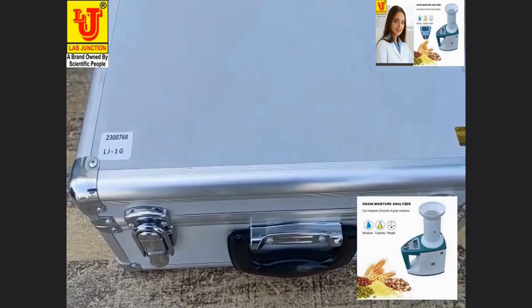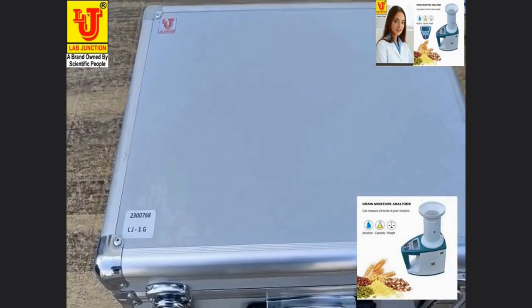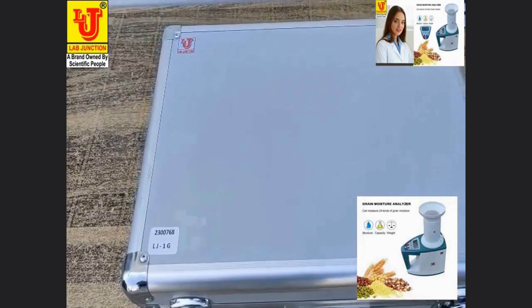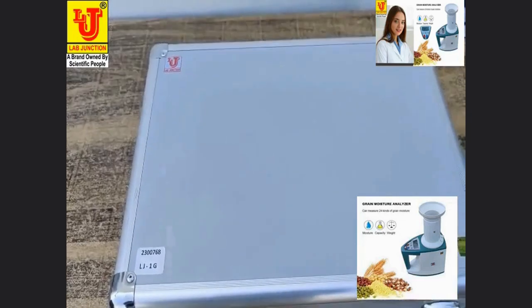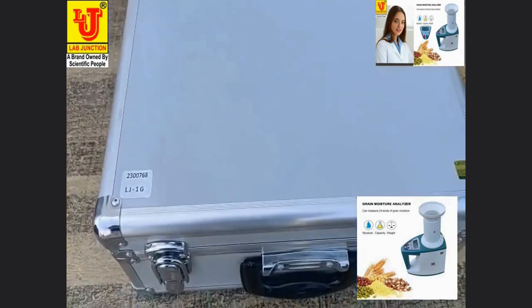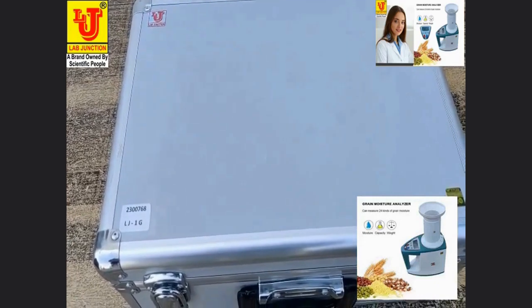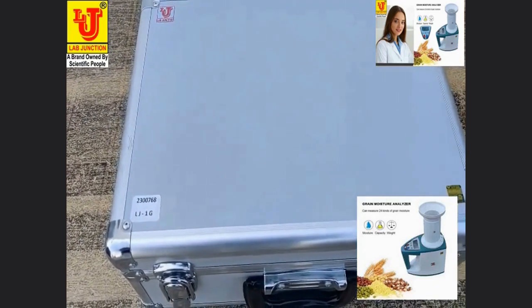This is the Lab Junction Green Moisture Meter, model LJ1G. This is our main instrument, equipped in a small suitcase.